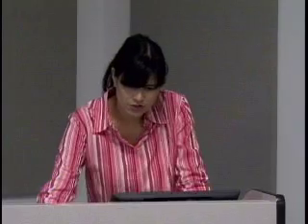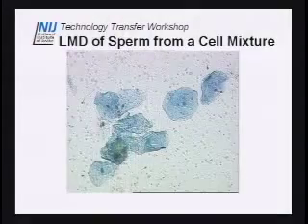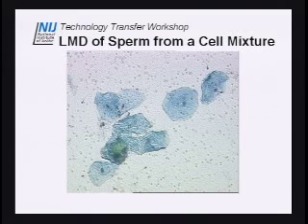One thing I want to add, which folds into this lecture, is the difference between what you will normally see in your sperm searches that you've been doing for years and doing it on the LMD. And this is what's nice about Pat going through the microscopy, because if you're a little weak on the microscopy, this is a system you really have to be brushed up on.